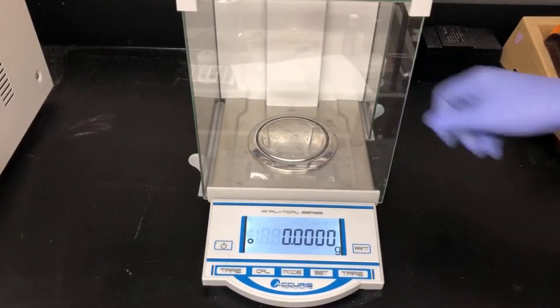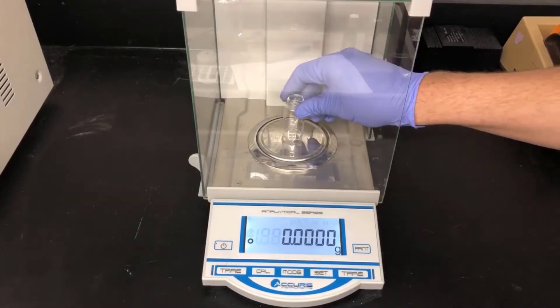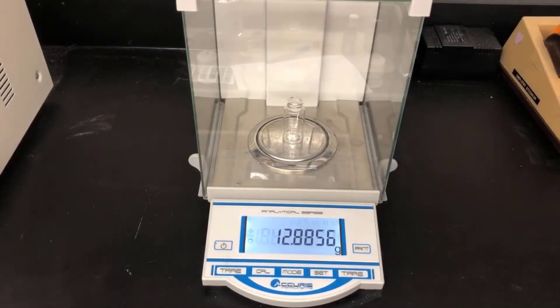Next, I'm getting a clean dry vial, and I'm going to determine its mass on the balance. This will enable me to determine the mass of the citrus oil by difference in the next step.